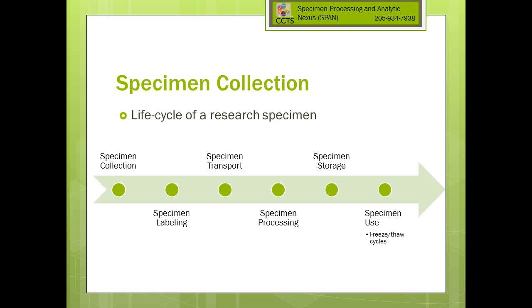That actually goes back to the specimen processing step, so how big your aliquots need to be. You need to think that through ahead of time to understand what you need to do to have specimens that you can use.